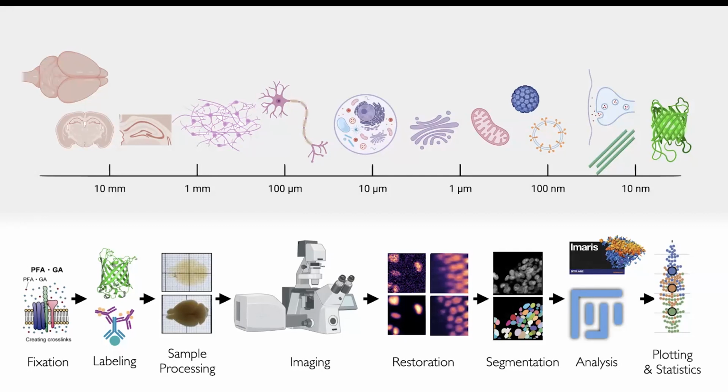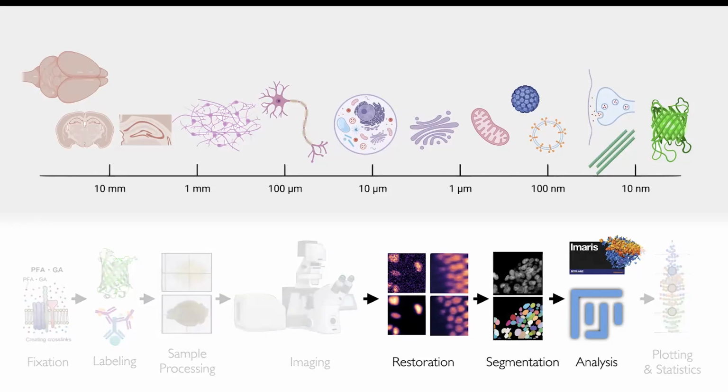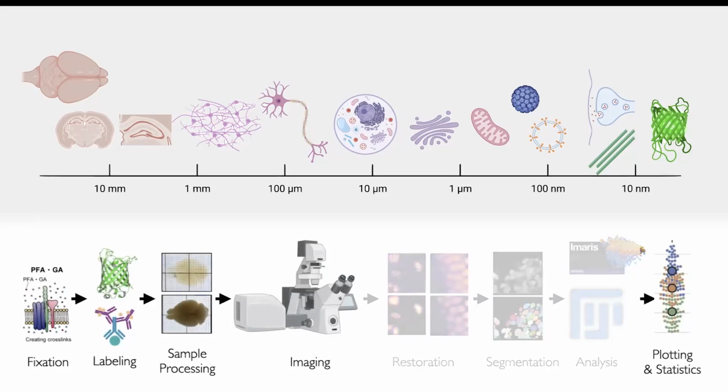So, going all the way back to fixation, the way you're mounting the slides, the way that you're imaging, those things will have a much bigger impact in improving your results than trying to tweak things at the end by adjusting segmentation algorithms and restoration. Even though the series is really focused on image analysis and processing, because this is the first session, we could go through briefly and talk about things that can help improve your outcomes in these earlier parts of the pipeline.